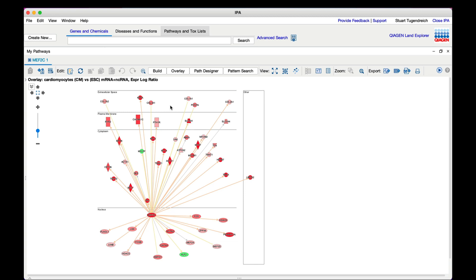Now let's investigate which diseases and functions are significantly associated with the MEF2C network, either MEF2C or its targets, and discover how the genes in the network might causally impact those endpoints.